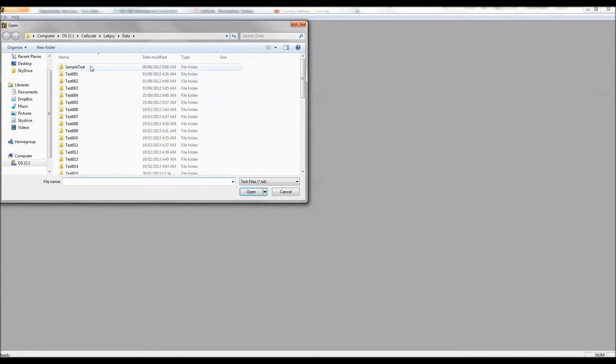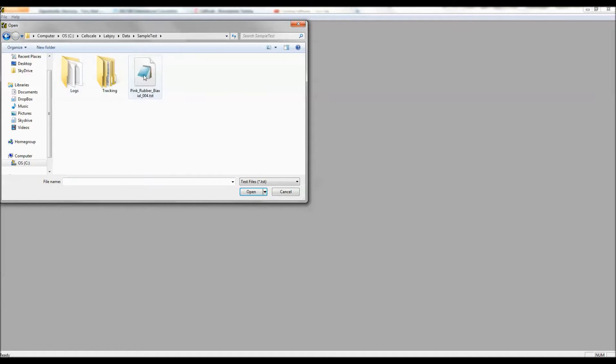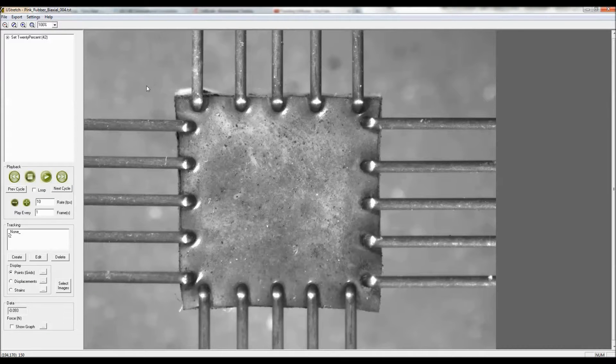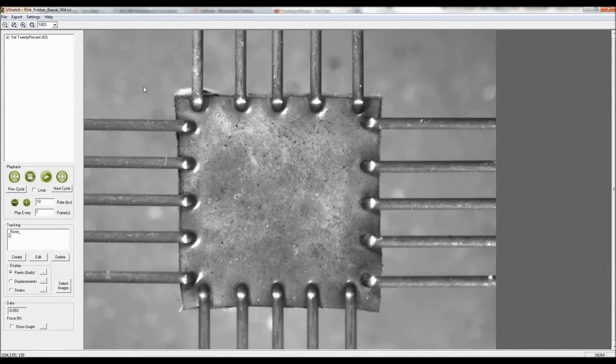First thing I'll do with this demonstration is pull open a set of test data using the analyze and review feature, and I have a test here that was done on a six millimeter by six millimeter piece of rubber.